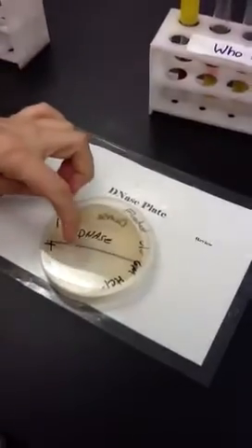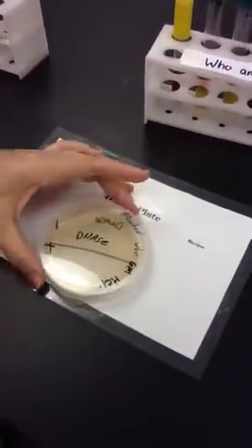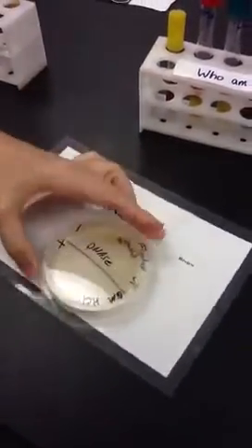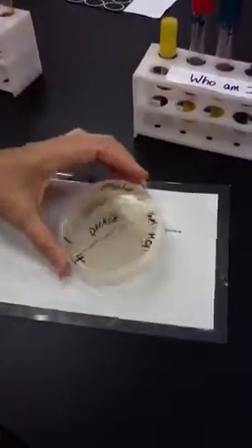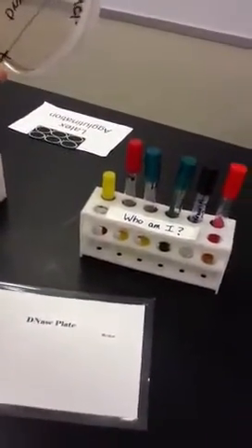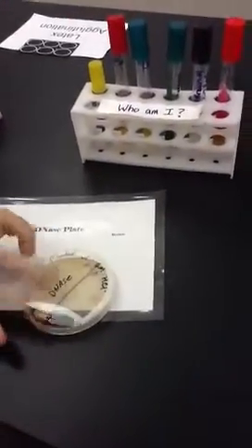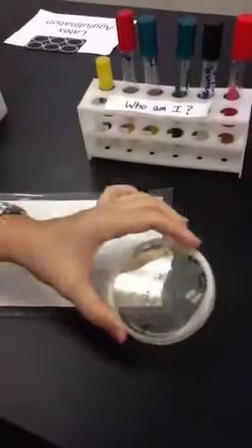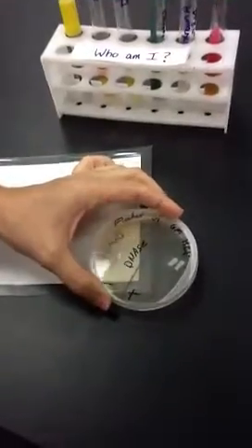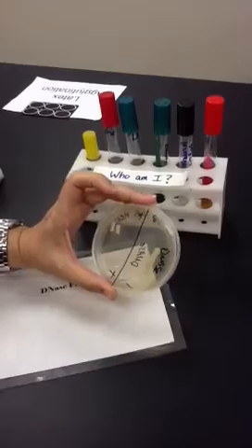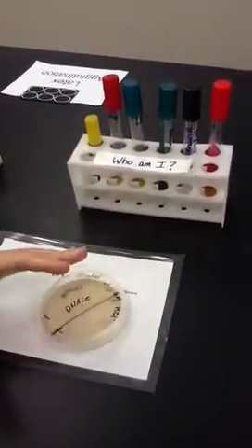Then the DNase plate. It's the same thing. Now, the DNase plate, you put hydrochloric acid on it after it's grown. You flood it. And then same thing, you'll have a clearing around the one that's positive, but not around the one that's negative. And this one's a little hard to... Whoa. Wow. It either cleared a lot or didn't clear nothing. Well, this one says that's positive, but I don't see any... it's hard to see a clearing around that anywhere. Do you see it? Let me see from the back. Maybe it had one before. Yeah, and maybe it just finished clearing. But if it clears, it's positive.